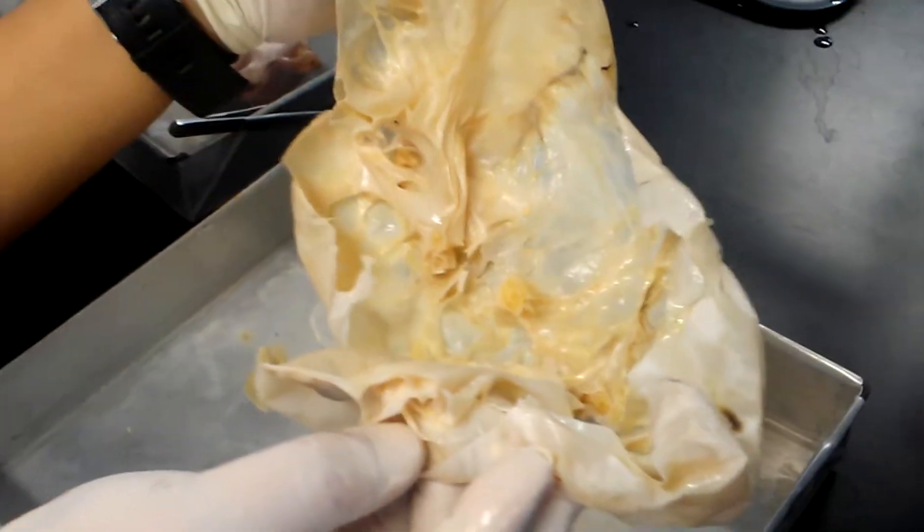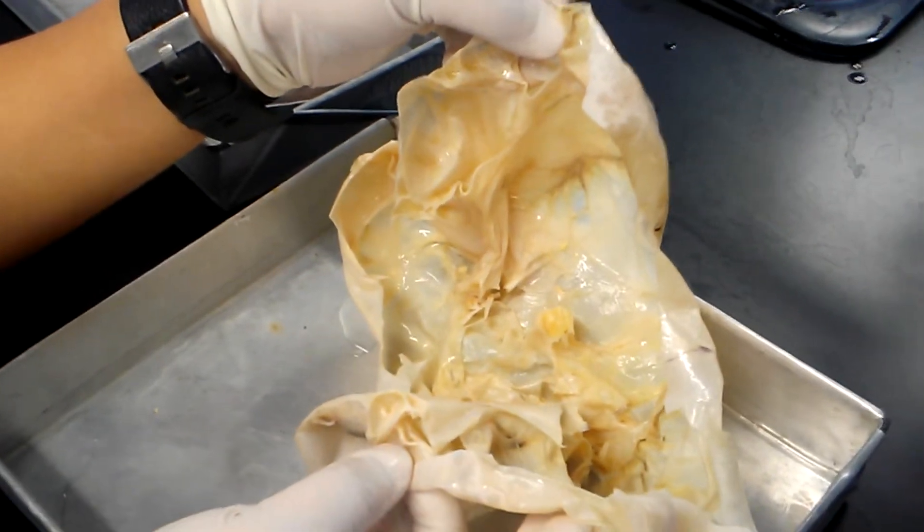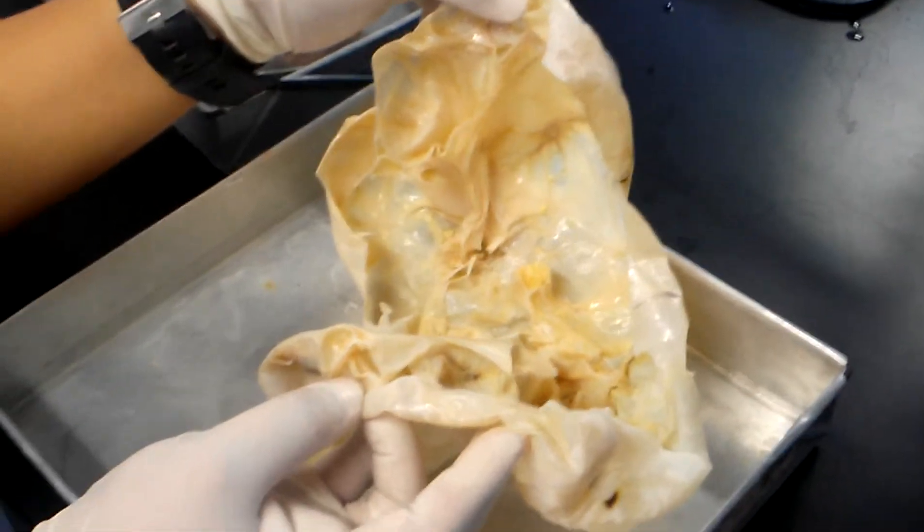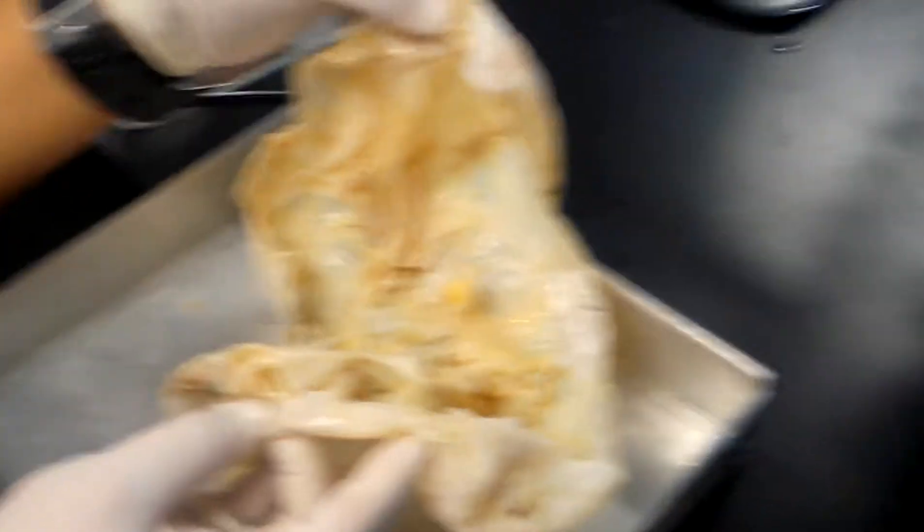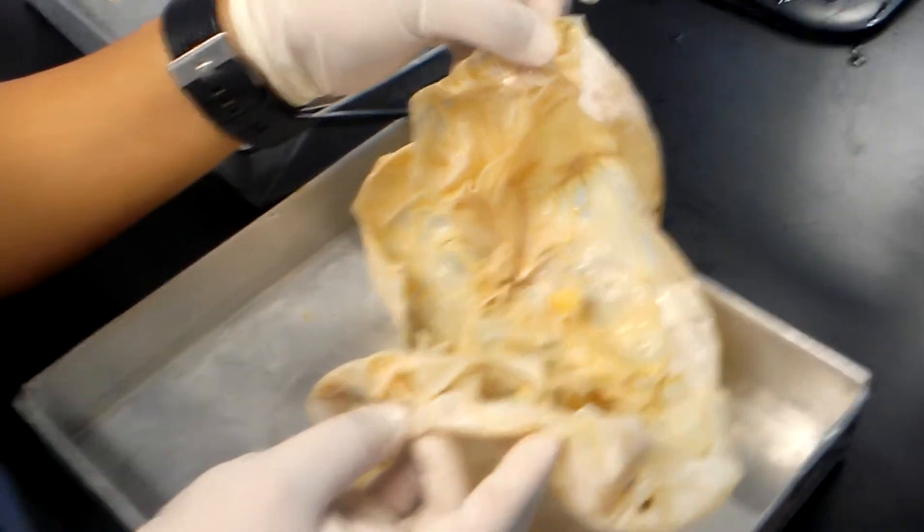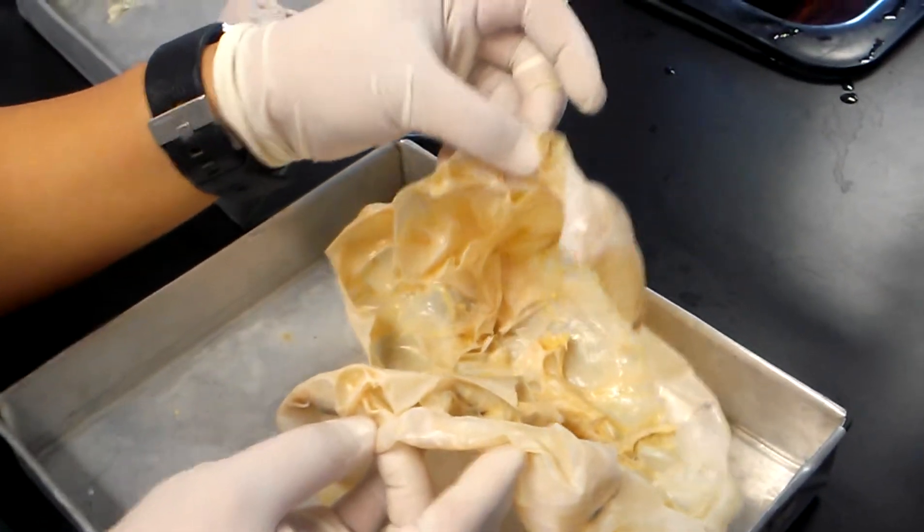And then when you section this one, in mucinous cyst you will see columnar epithelium with mucinous cyst. In serous, it's usually cuboidal or short columnar type of epithelium.